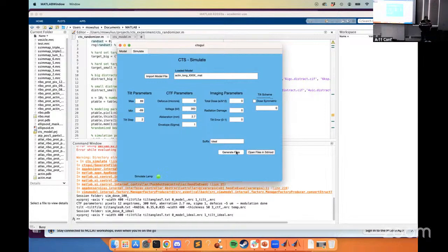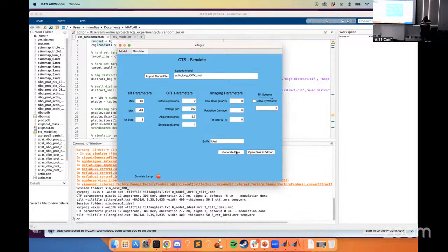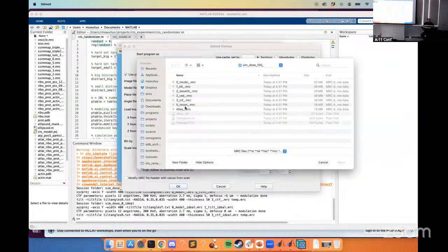Yeah. On a technical level, if you have the 0 dose setting, that means there's absolutely no loss of electrons, effectively an infinite dose, and that will give you crazily good images with insane signal. That will prevent you from doing anything else with that data. You won't be able to segment it with something trained on normal looking data, but you can have a much less harsh regression denoising. You just have a high dose rather than infinite dose, and you have some radiation damage, but not too much.